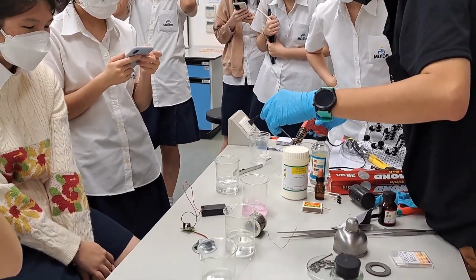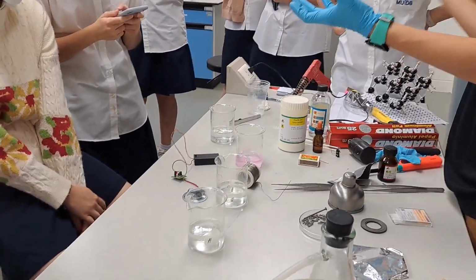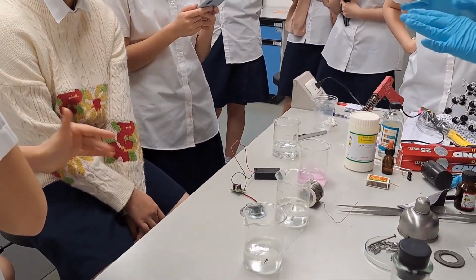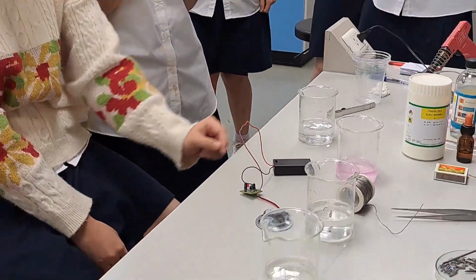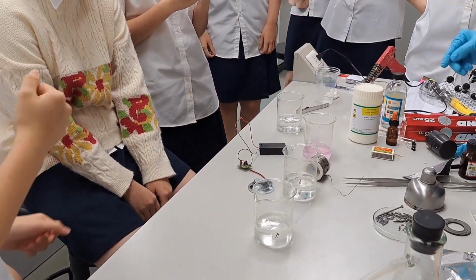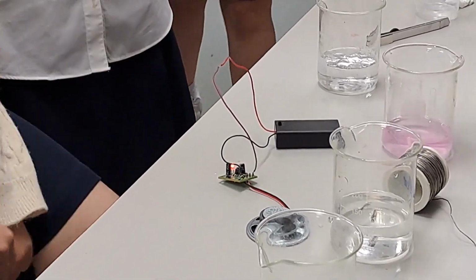It should connect by now. See? It's like you have ice, you put a popsicle stick in. Oh no, I mean you have water. Why does it not have sound? I haven't turned it on. Okay, let's listen. Alright, that's conductive, it can conduct electricity.